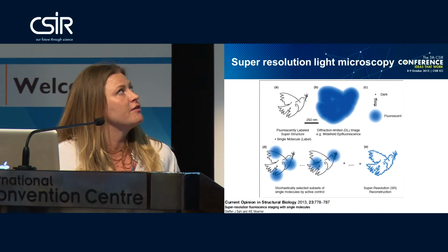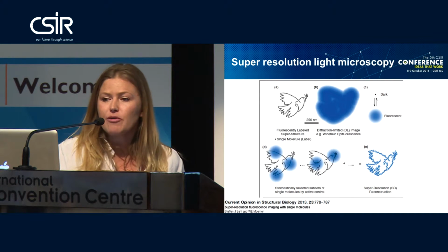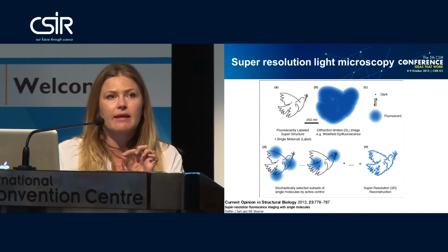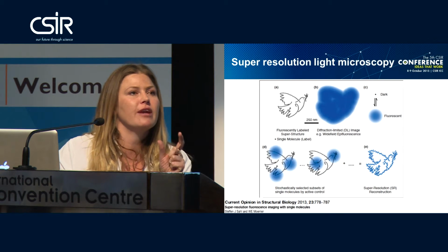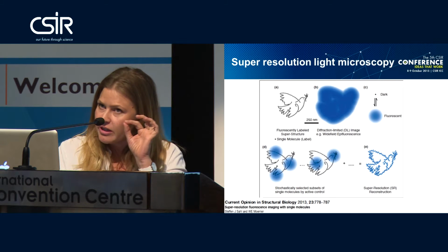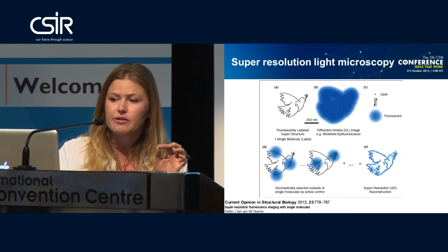And if we wanted to fluorescently label those, unfortunately, because of the physical properties of light, what you're going to land up with is something like that. We can't actually break through that diffraction limit of light, which is 200 nanometers, okay? Even though the whole structure is larger, the individual molecules that make up this delicate structure are much smaller. So that's what you would land up seeing even with a confocal microscope.